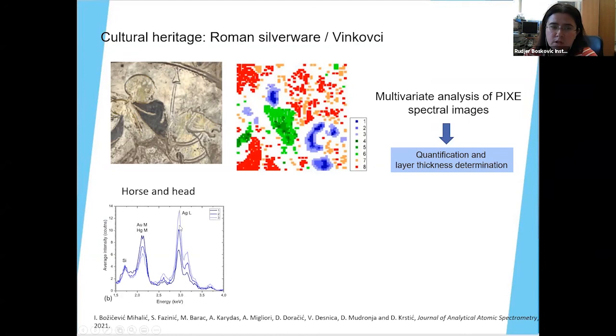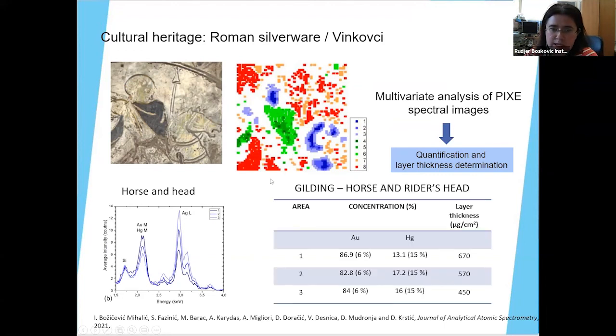So taking into account that we have a thin layer of gold, we have silver X-rays passing through this gold layer and being absorbed. So this made it possible to analyze the thickness of this gold layer, because, for example, the regions where you have the dark blue are the thickest regions, and here you have the highest intensity of gold, but the intensity of silver, since the X-rays are absorbed in the gold layer, but not completely, is low.